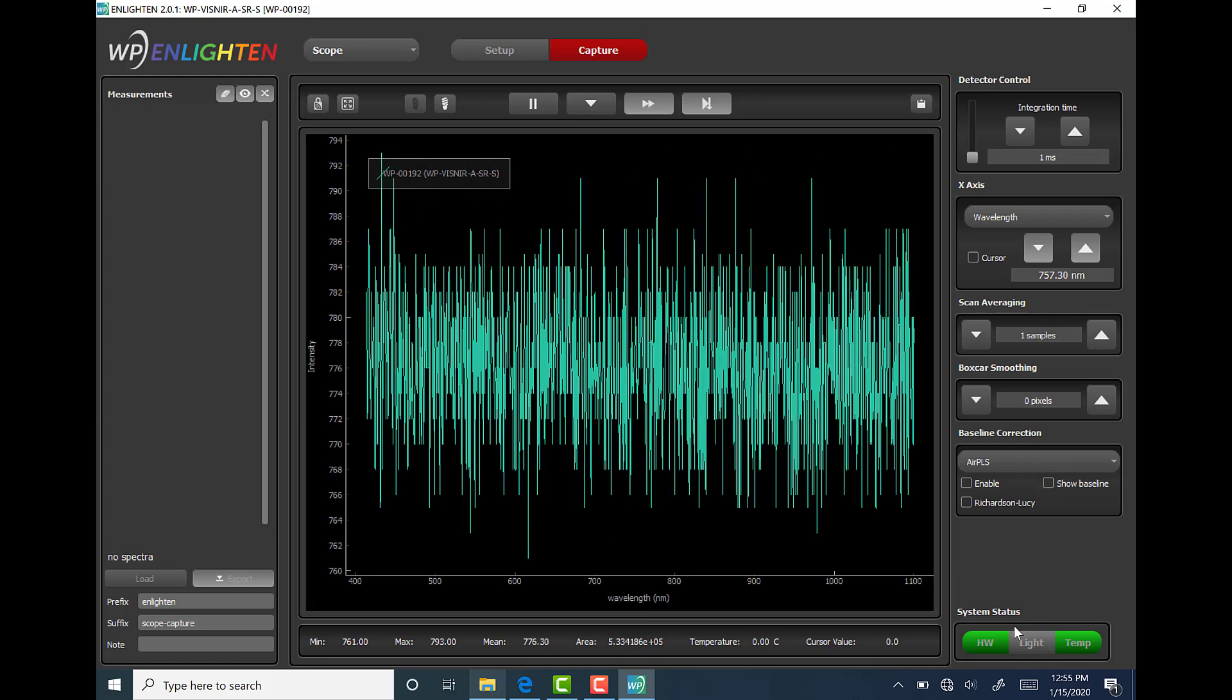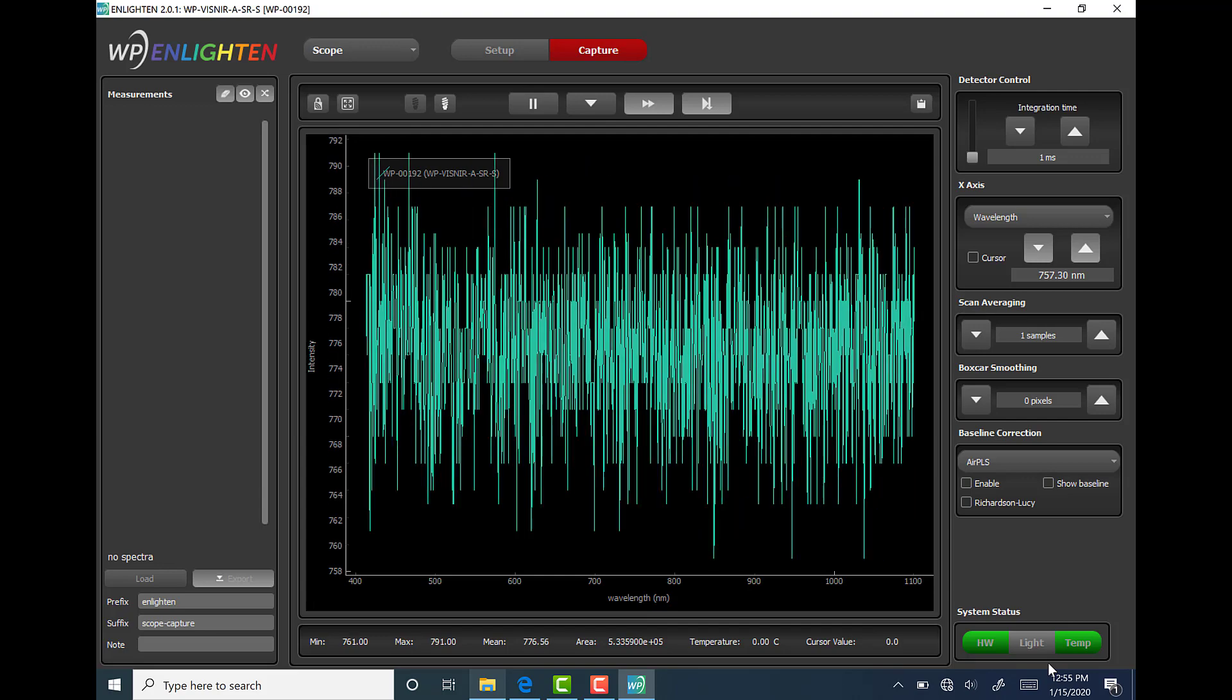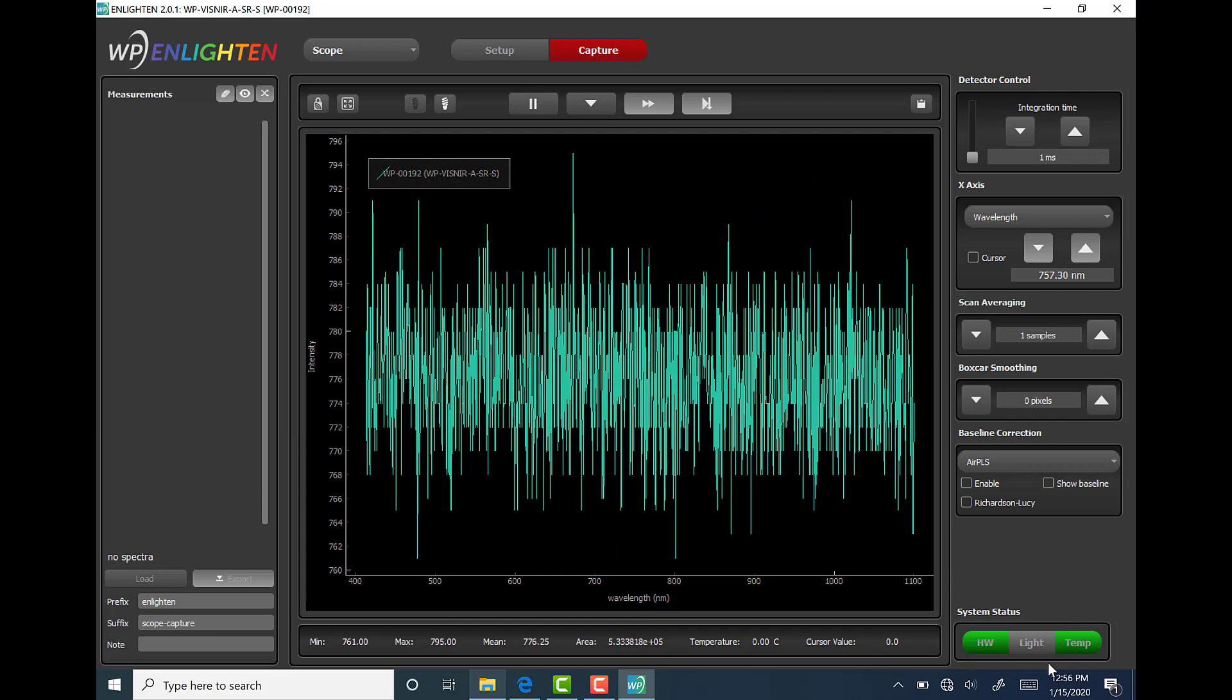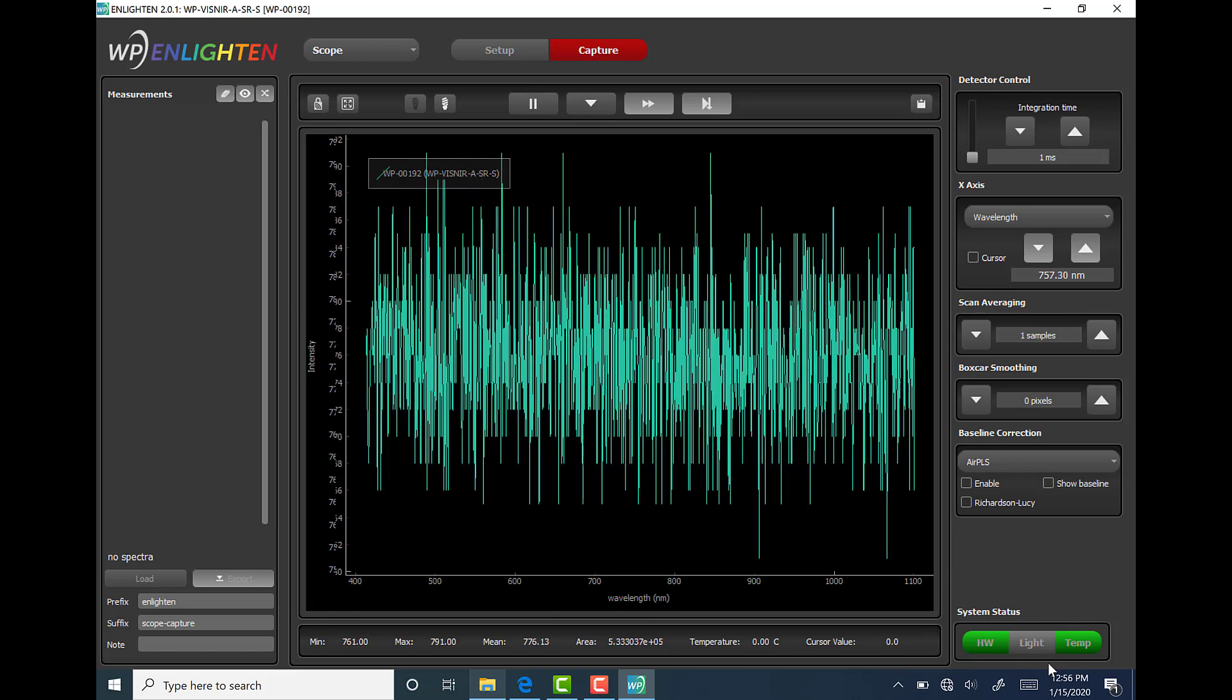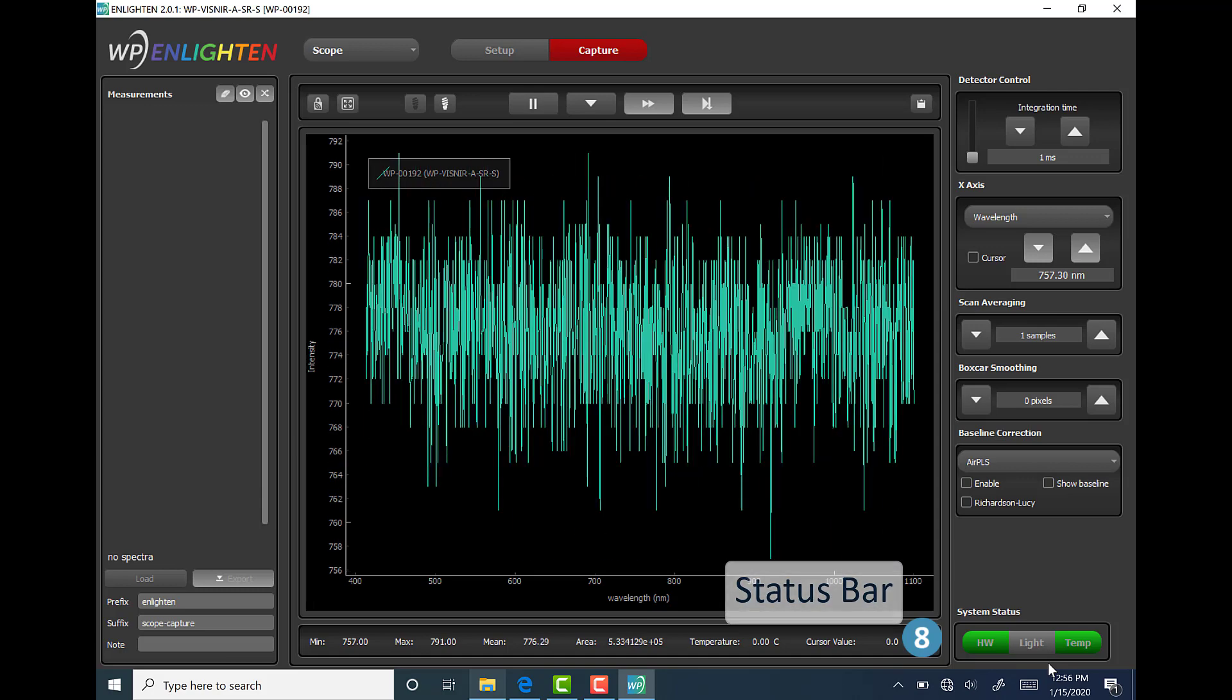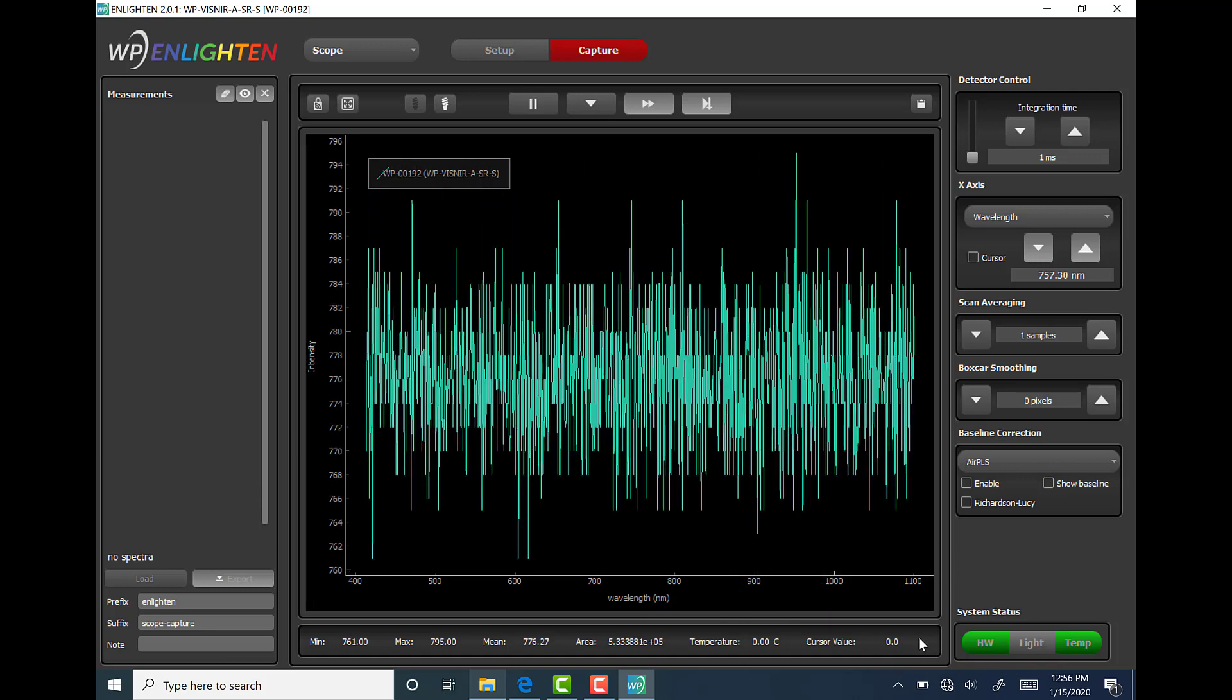For example, in my window, light is grayed out because the visible near infrared spectrometer that I have connected currently doesn't have an internal light source such as a laser.